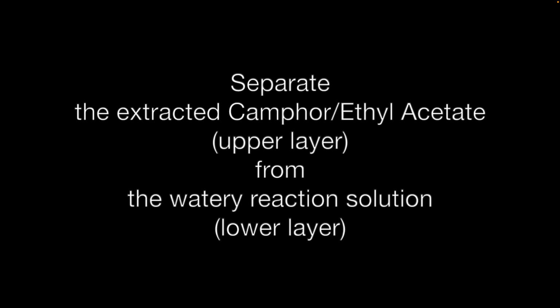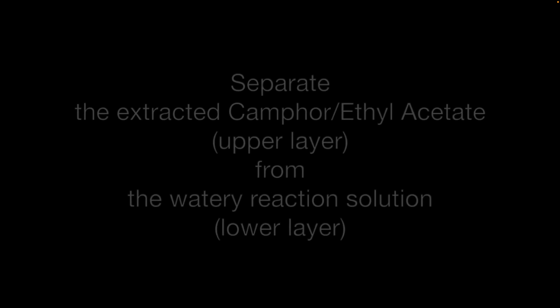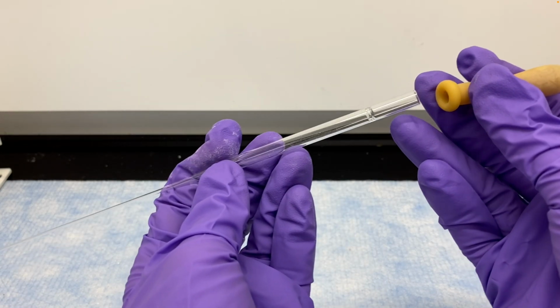So now all the camphor will have gone into the ethyl acetate. It won't be in the water anymore, and it's just a matter of mechanically separating the water from the ethyl acetate layer. So the ethyl acetate with the camphor product that we want is going to be on top. It's less dense. The water solution with all the waste is going to be on the bottom. It's more dense. And this is where the pointed tip of the centrifuge tube becomes significant.